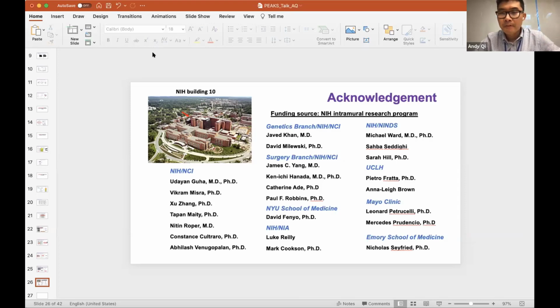Yes. The comment I would make is that we tend to do fairly extensive fractionation of the material, and there you do start to see a lot more of the different PTMs, and particularly the phosphopeptides, and that's without phosphopeptide enrichment. So, I guess particularly in the context of cancer, obviously those types of antigens are of great interest as well. Yep, for sure.